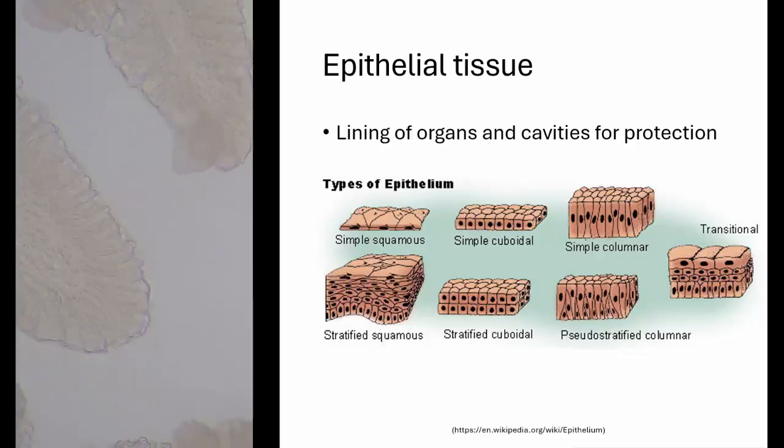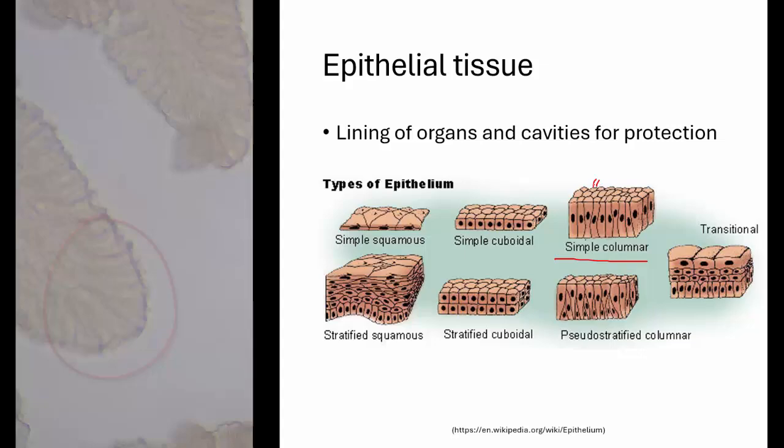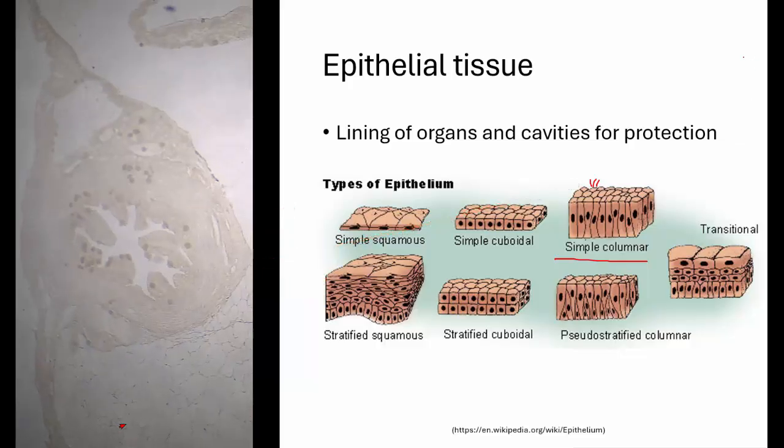And this one looks like either simple columnar or pseudo-stratified columnar. I can't actually tell very clearly, and I'm just trying to show the cilia on it. So there's often other parts added into these layers, and as you could have seen from the by 40, it's either lining the outside of the organ or it's lining various tubes inside the organ.